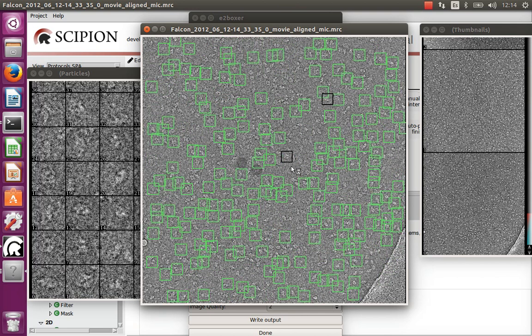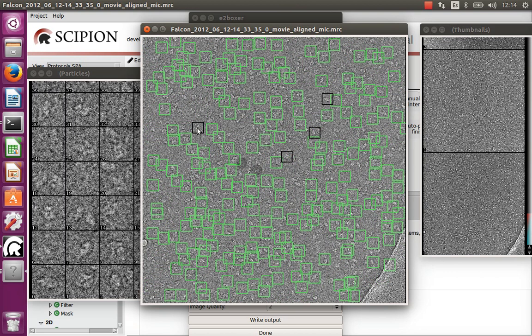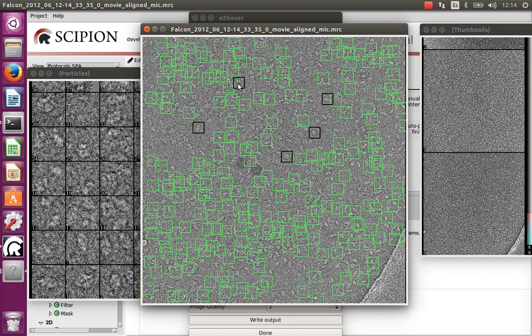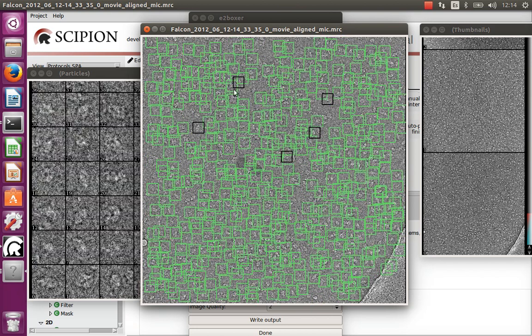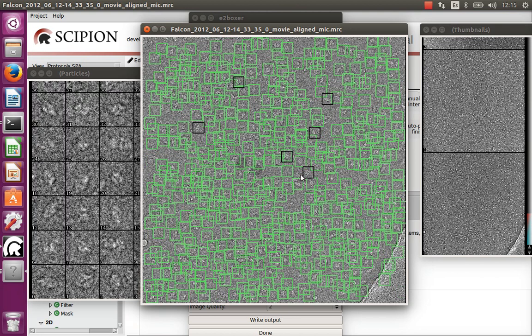We can center it again. And then we can center this one. We can give this one. We can center it. It is important that you give accurate information. If you don't correct, then the algorithm quickly derives into very bad predictions, because the model drifts from good data to bad data.